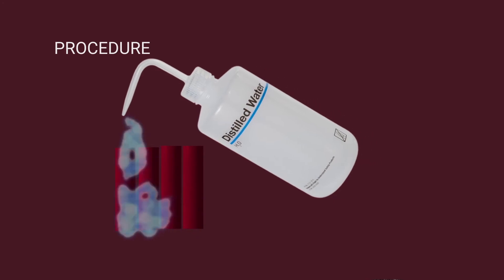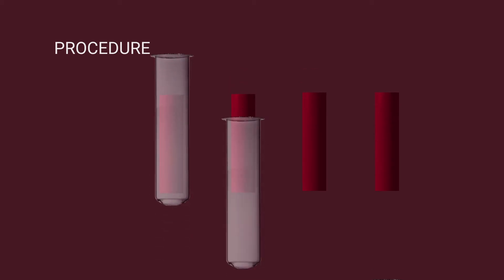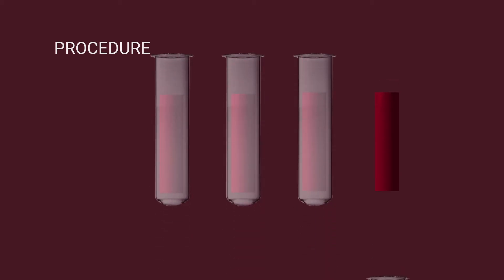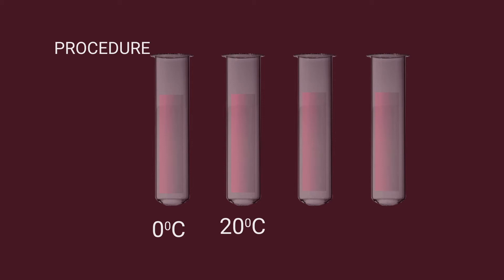Each of these pieces is placed in a separate test tube containing water at different temperatures, for example, 0 degrees Celsius, 20 degrees Celsius, 50 degrees Celsius, and 70 degrees Celsius.